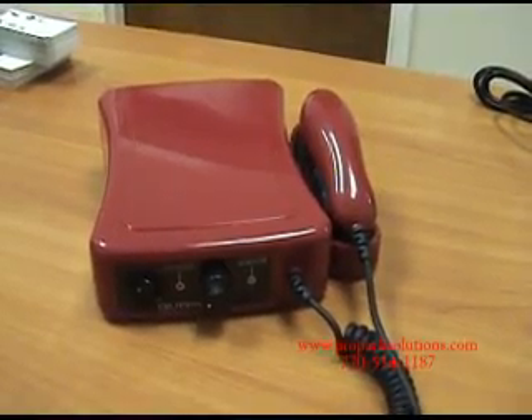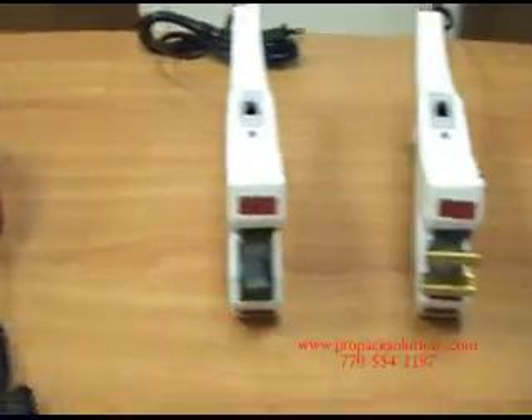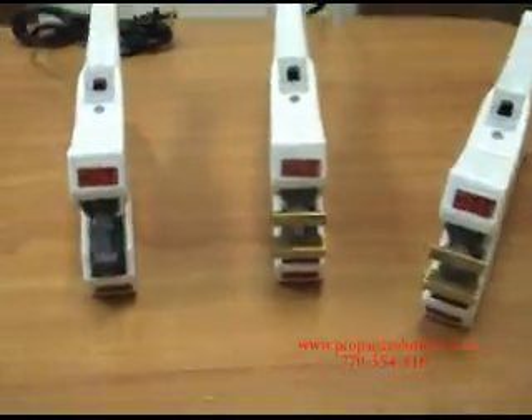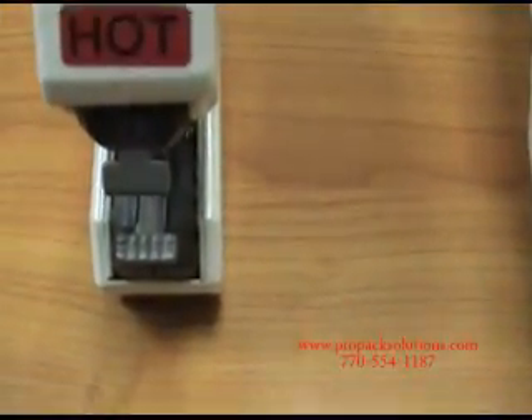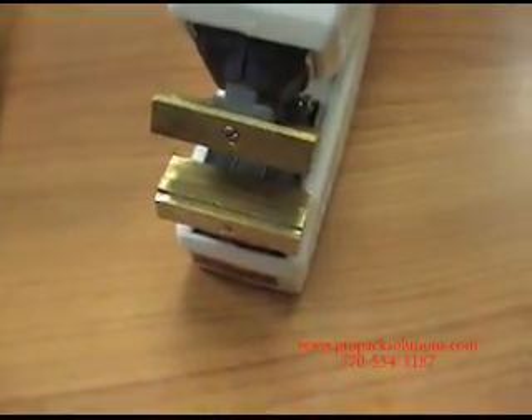This video is going to explain the difference between sealing with the Quappa ultrasonic sealer and the DPC-10 units — the standard jaw, the rib jaw, and the jaw with the line.